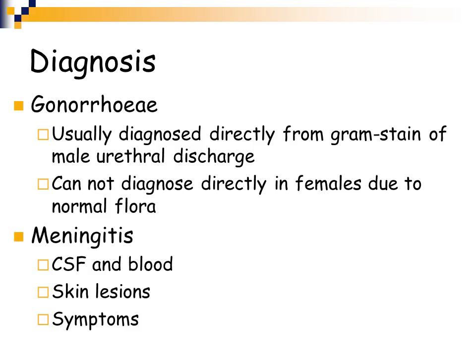So if you get a female cervical swab in, you cannot just do a direct gram stain. You have to actually plate out that swab onto your non-selective and selective media, incubate it, wait at least 24 hours, and then work that organism up. And the reason is, females have a lot of different normal flora in the genital urinary tract.